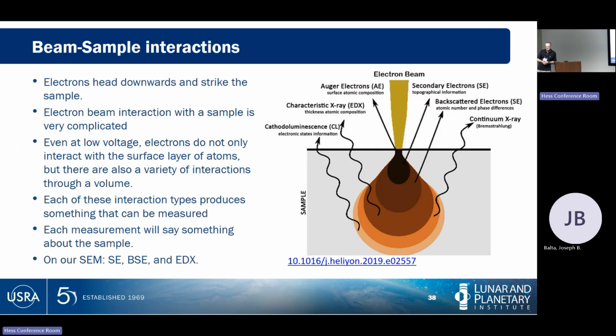They don't have to saturate it more. Oh, there's a lot of things that still use them. There's a new kind of filament, I can't think of the name. It's some kind of tungsten, which is not in the least bit like the traditional tungsten.